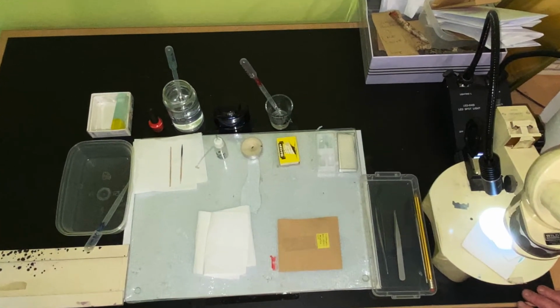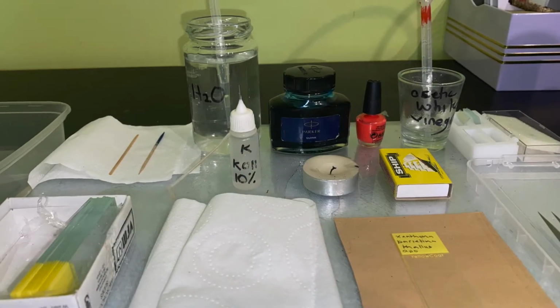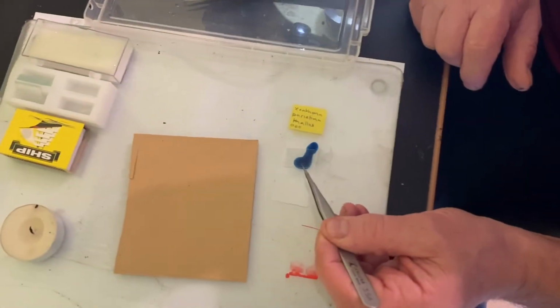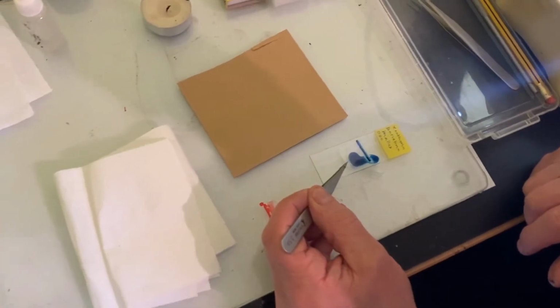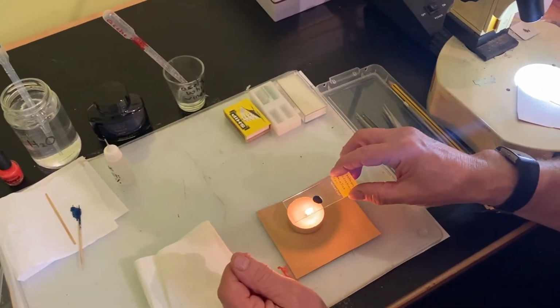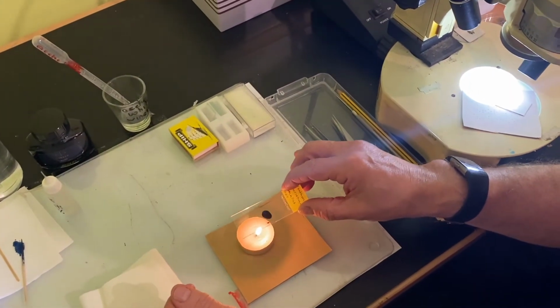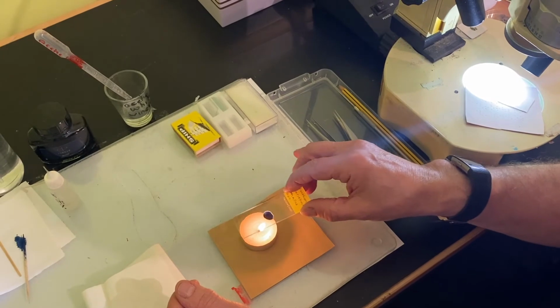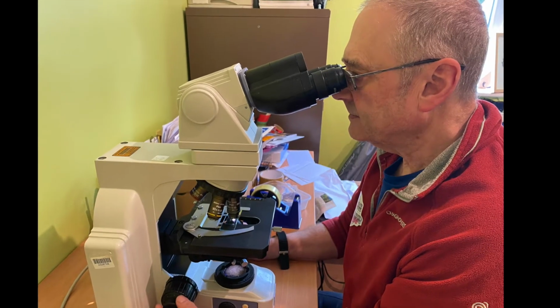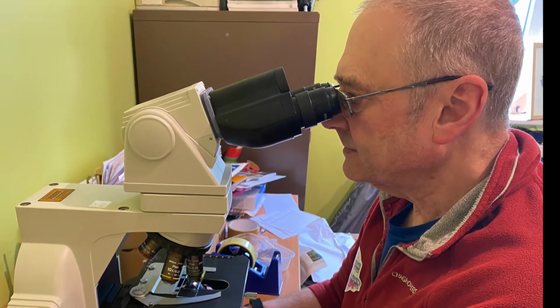This video will take us from the point at which thin sections have been cut from the lichen to the point at which slides are ready for detailed microscopic study. It will only show the preparation of a squash for spores. Similar but slightly different techniques would be used for the preparation of other samples, for example, a spore squash in water or a cross-section of an apothecia to study its anatomy.